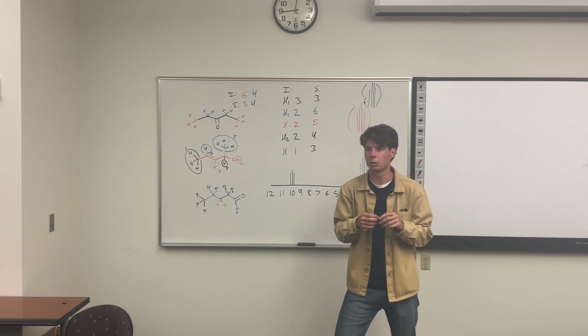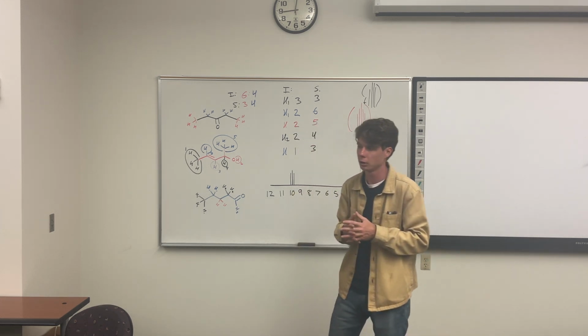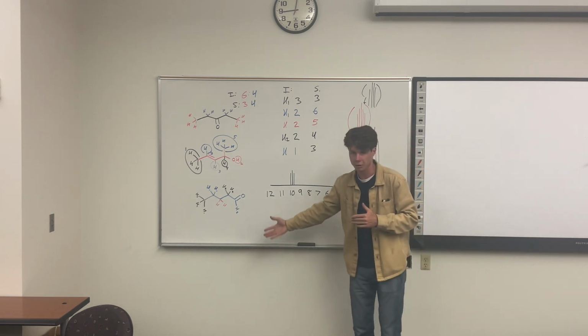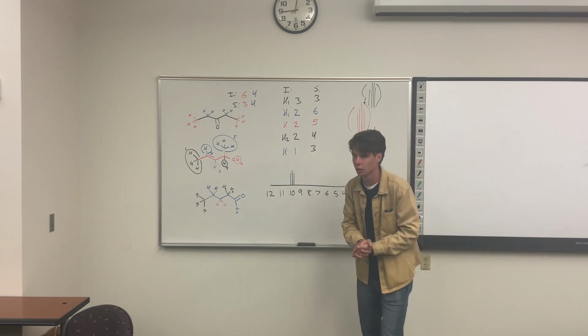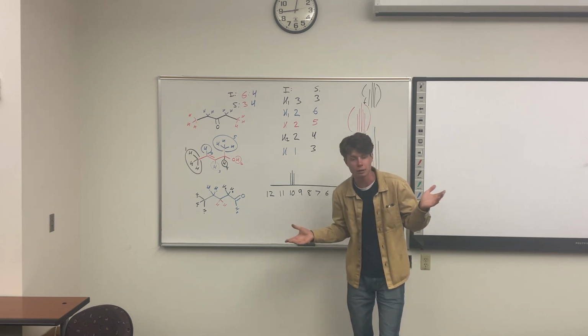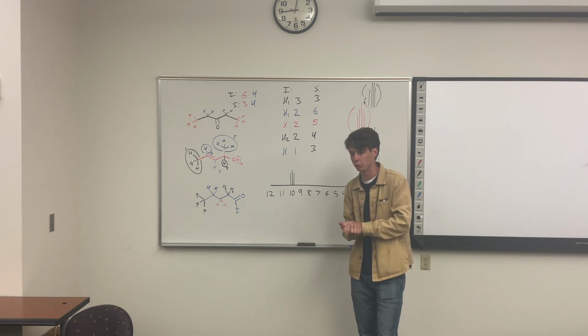HNMR is just going to be memorization, because there's no splitting, there's no intensity, just functional groups. I might make a Quizlet. There's probably already Quizlets made. Maybe I can just use those for knowing what these functional groups are. For example, aldehyde's going to be at 10. That's nice to know. So none of this you'll be assessed on, but it should show up in ACS, well, it will show up in ACS. So it will help you get to that 70% threshold.